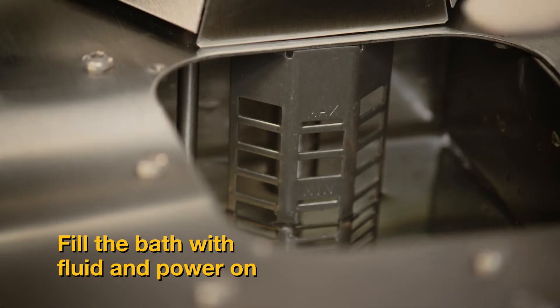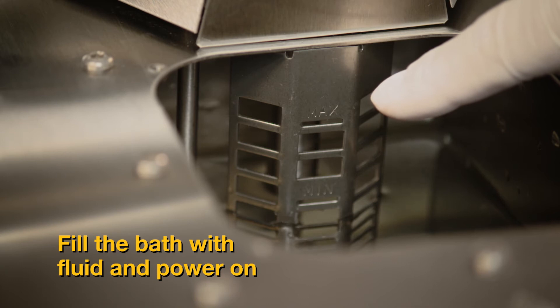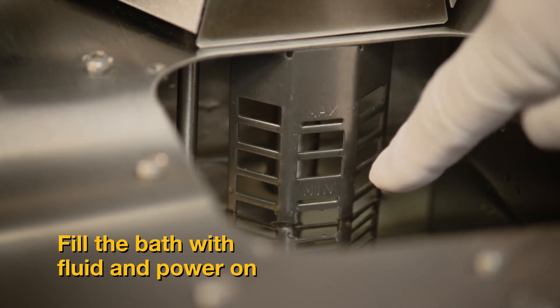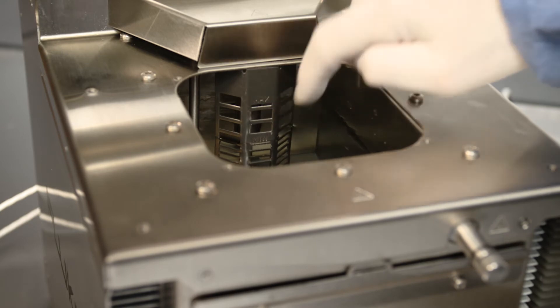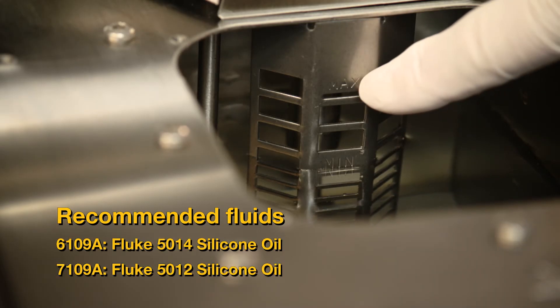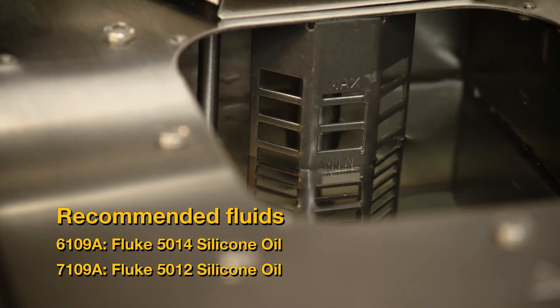First, notice that the stir guard has max and min marks to indicate fill levels. Fill the tank to the min level if your set point is greater than ambient. Fill just below the max level if your set point is less than ambient.